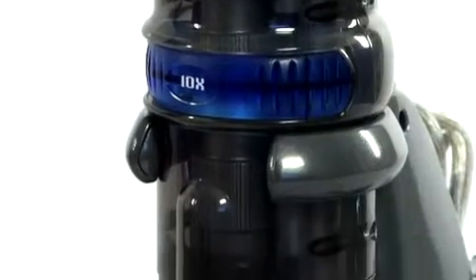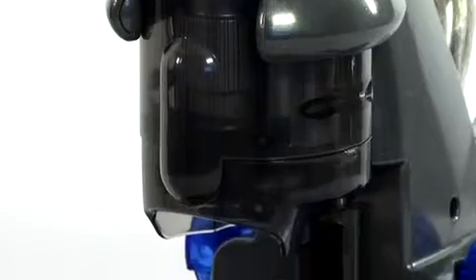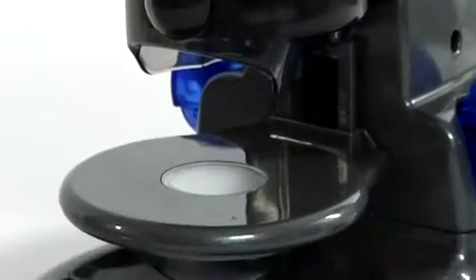Get children to play the smart way with the Digital Blue Series QX5 USB Computer Microscope. Kids can use this microscope to view their favorite goodies, ants, bees' wings or even their school lunch.